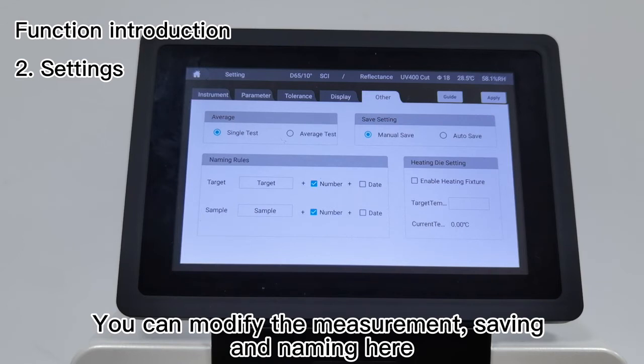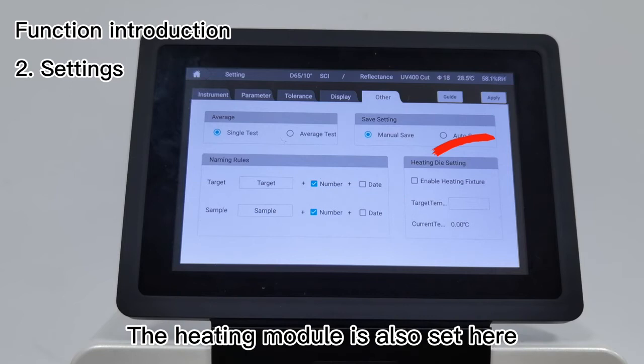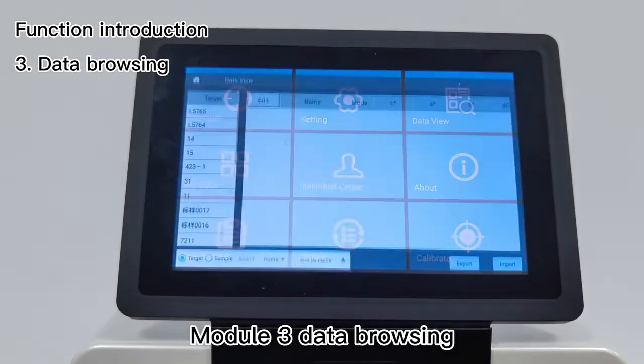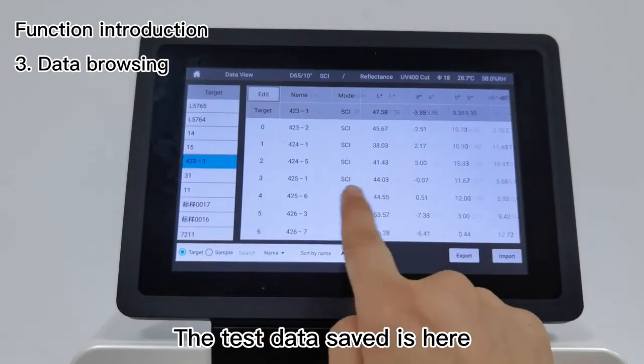Module 3 - Data Browsing: The test data saved is here. Long press to delete and call out the standard sample.